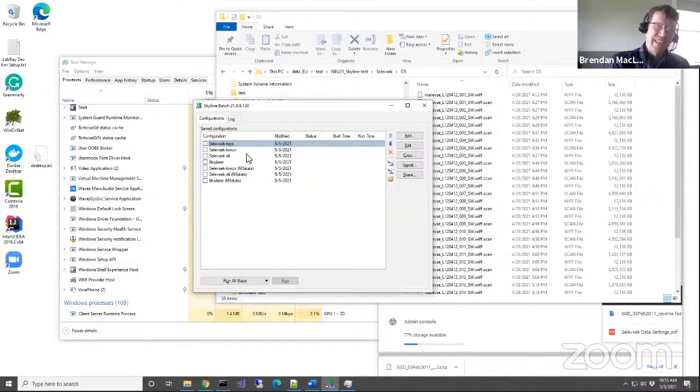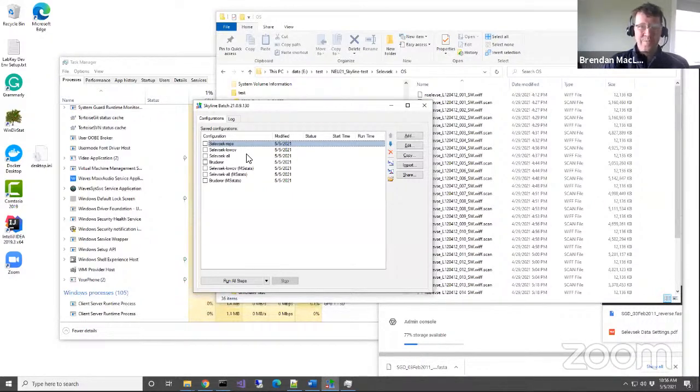Whenever you're measuring anything, how well you can measure it is determined by the signal to noise, and you can either have a lot of signal, or if you decrease the noise, you can still decrease the signal. That's the mass spectrometer doing SRM and PRM. Those decrease your signal, but they decrease the noise so much more that people do them.